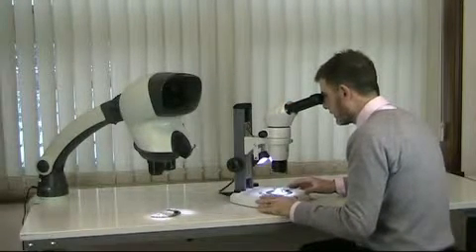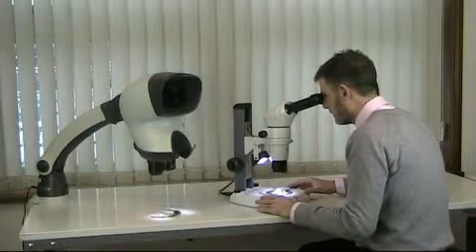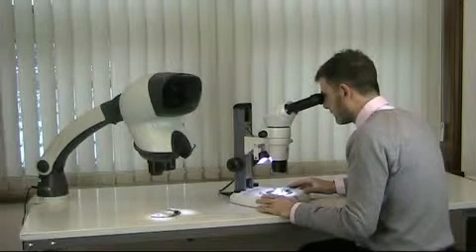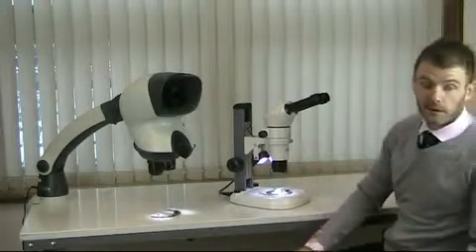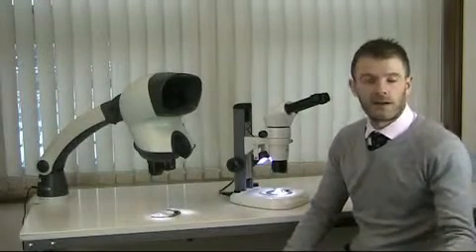Now, not only is this tricky, but it means you must maintain a fixed body posture. And over a period of time, that's tiring. It's also tiring for the eyes and for the neck.